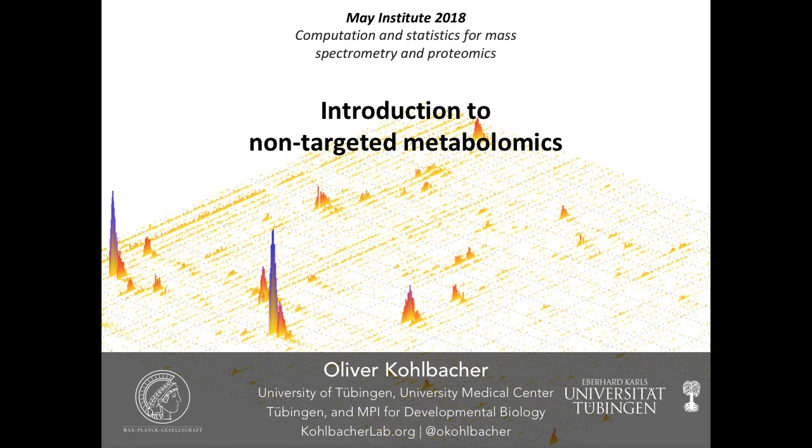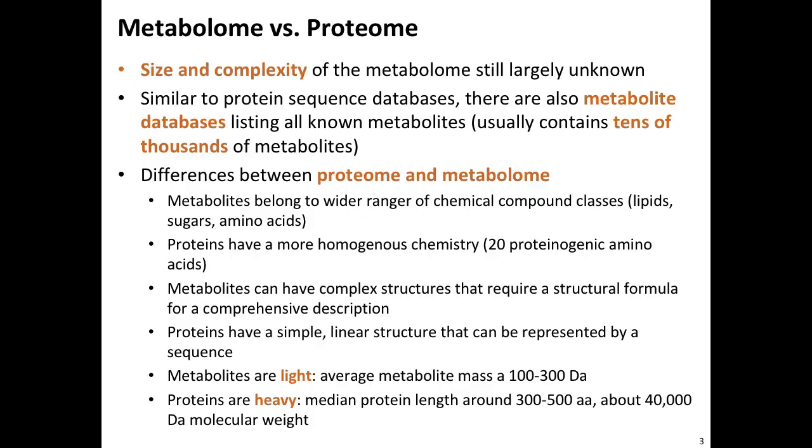Now for something completely different, we switch gears and go from proteins to small molecules, and we will talk a bit about non-targeted metabolomics, but you will notice pretty quickly that many of the things that we've discussed this morning will be reasonably similar to what we're going to be doing with metabolites. In the end, it's all doing mass spectrometry.